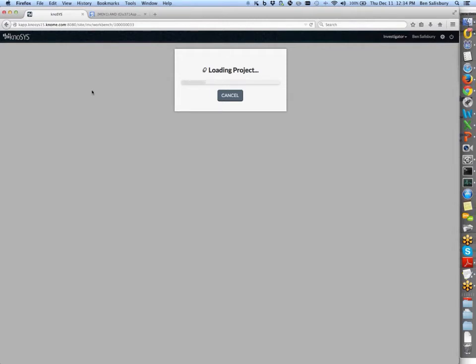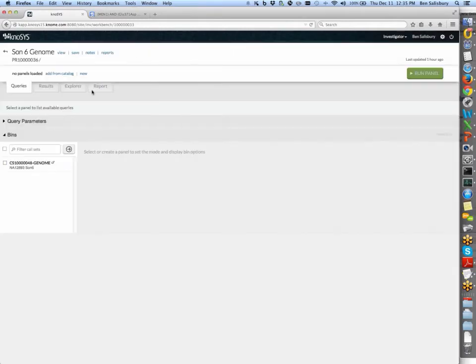This time we're loading up a whole genome because there are variants that fall outside of your standard targets of these genes. So promoter or regulatory elements can, of course, be far upstream or downstream or even farther afield than that relative to the coding regions of a gene. But so here we have our son 6.